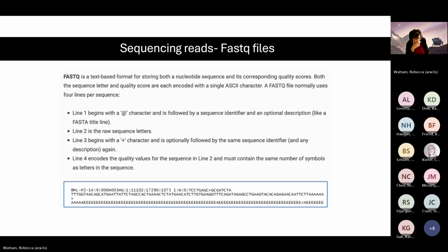After I stopped sequencing gels myself, there was a time when you would get back stuff from the sequencing center, often a handout or a file that you'd open on your computer, and it would show you areas where it was unsure of the sequence. Like if I was reading a gel, it would show me places where I couldn't distinguish between the C and the T at that particular point. So this is telling you that kind of stuff.